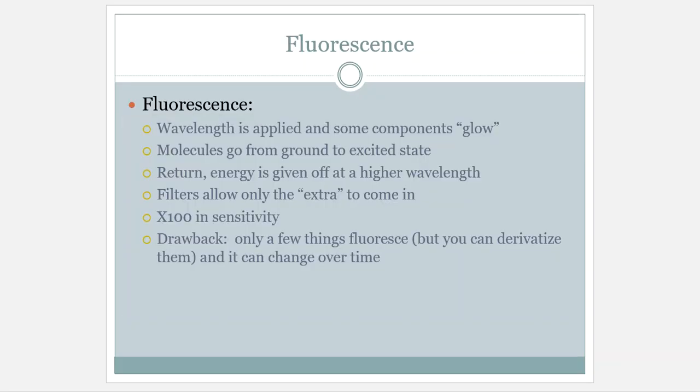Absorbance is only one part of the factor, though, because we can't forget about fluorescence. And fluorescence is something that we could have talked about in spectroscopy as well. We don't do a lot with fluorescence, and that's why sometimes I just leave this little nugget of information out. It seems like very few things can be run on a fluorimeter, and fluorescence is needed in order for a sample to be analyzed on a fluorimeter, but we also have this option as well on the scanners and on HPTLC.